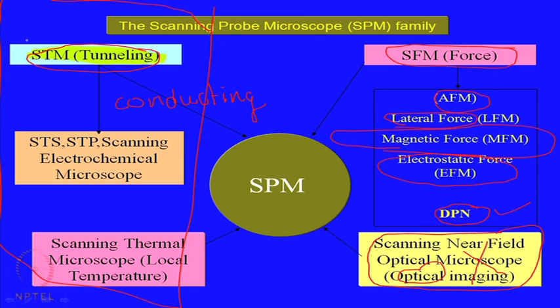We will talk only a little bit about the STM, very little, just the very fundamental basics of STM, and then we will move on to the AFM. As I have already pointed out, I will try to give you a perspective so that you understand the operational aspects of an AFM along with the physics and the key components.